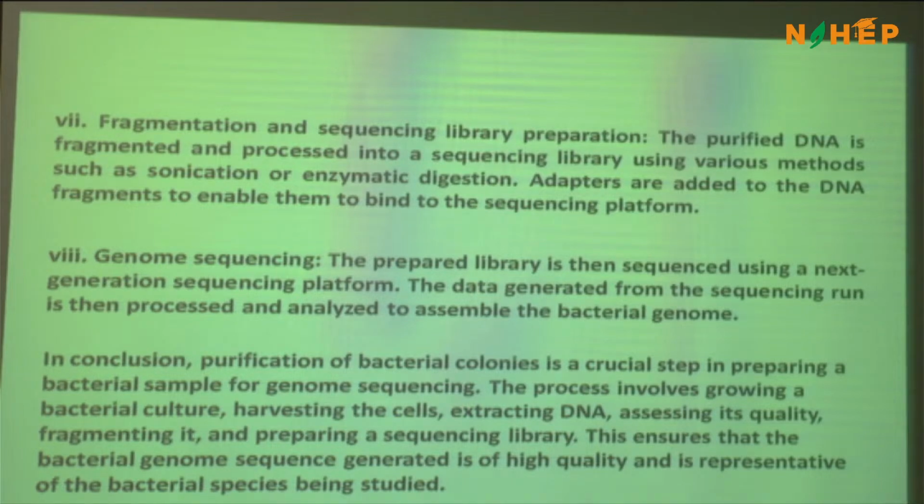Now the question is, why 5 times? Why not 2 times? Or why not 10 times? Right? You do it yourself, you will understand why 5 times, because on the 5th and 6th washing, you start getting some chlorophylls peeling off. Right? That is an indication that you have taken everything. The plant has started leaving some of its material into the extraction. So you can stop comfortably, right?